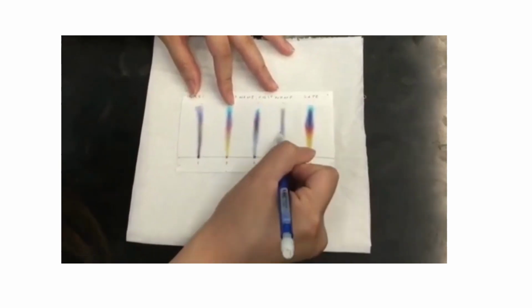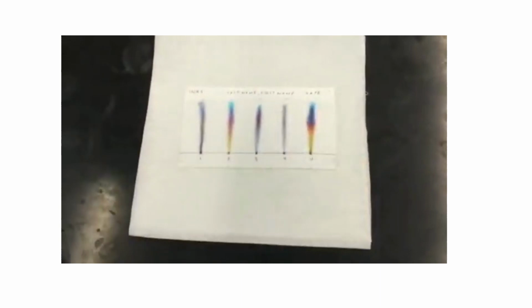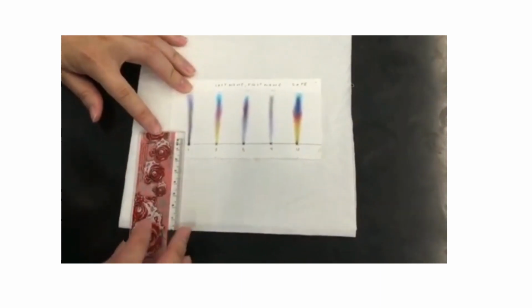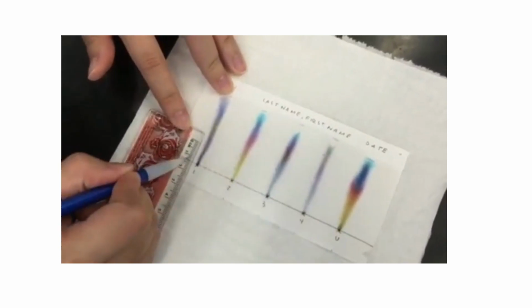RF value is the distance traveled by the particular substance divided by the distance of the solvent front, and if you calculate that value, we can find out the substance that is present, and the drug can be analyzed from the known values.